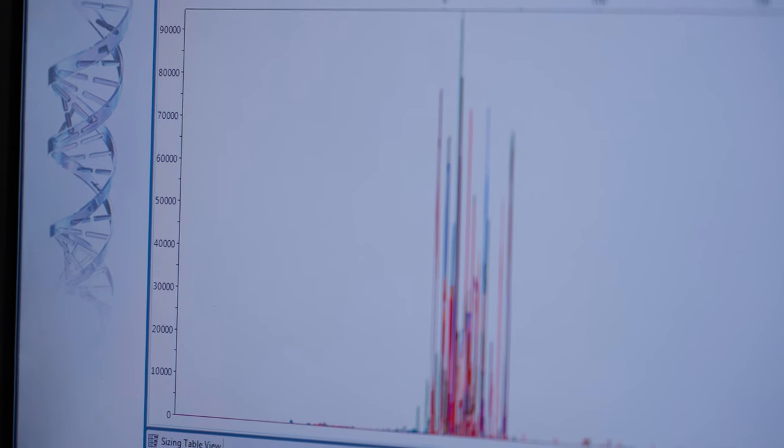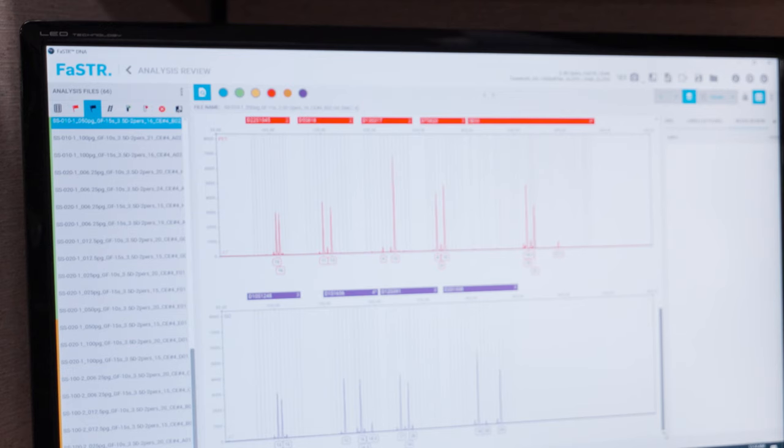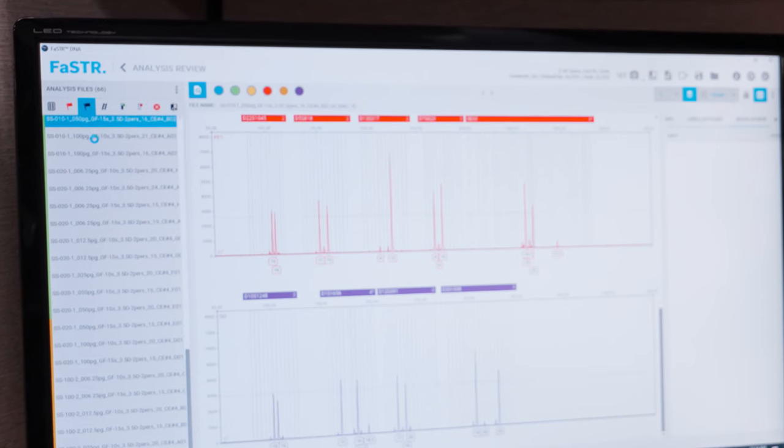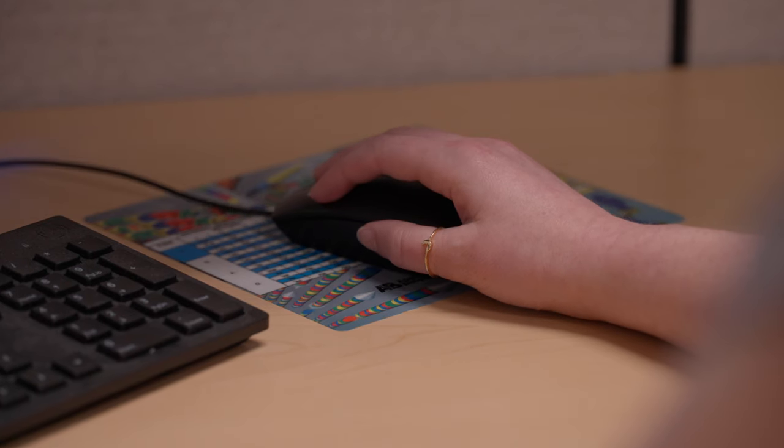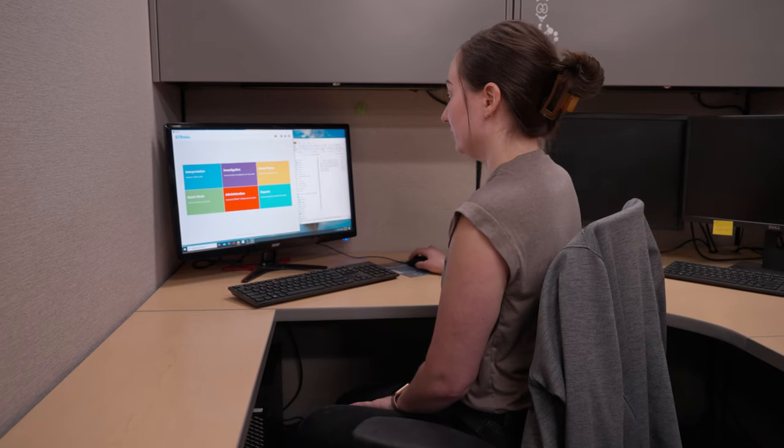Once the samples have finished processing on the CE instrument, the data is analyzed in a program called FASTER. This software takes the light emission data from the genetic analyzer and converts it into DNA data that the analyst can interpret.